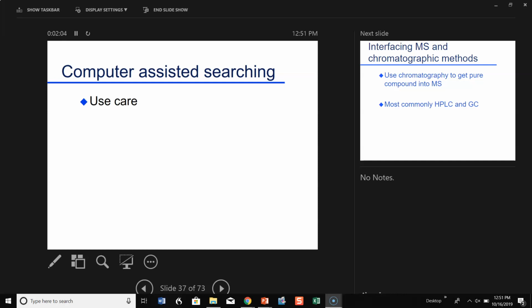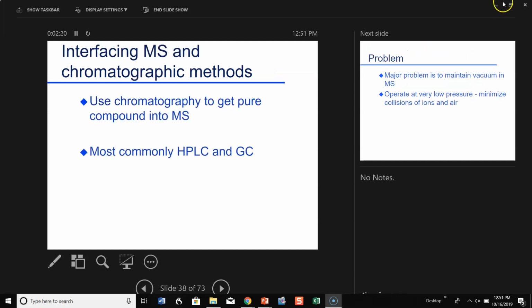The computer made judgments. Computers don't make good judgments all the time. And anytime you start substituting a machine instead of people, instead of some thinking, you put yourself in real trouble and it can cost you very dearly. So again, the computer will always put out some kind of a response, but don't assume it's correct. Make sure you check that always.